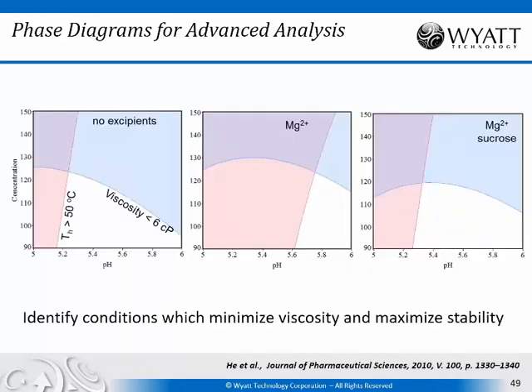You can go beyond that. In fact, some of these authors from Amgen have published more advanced papers where they combine multiple assessments of a formulation to create phase diagrams such as these. For instance, at a given concentration and a given pH, how does the aggregation behave?